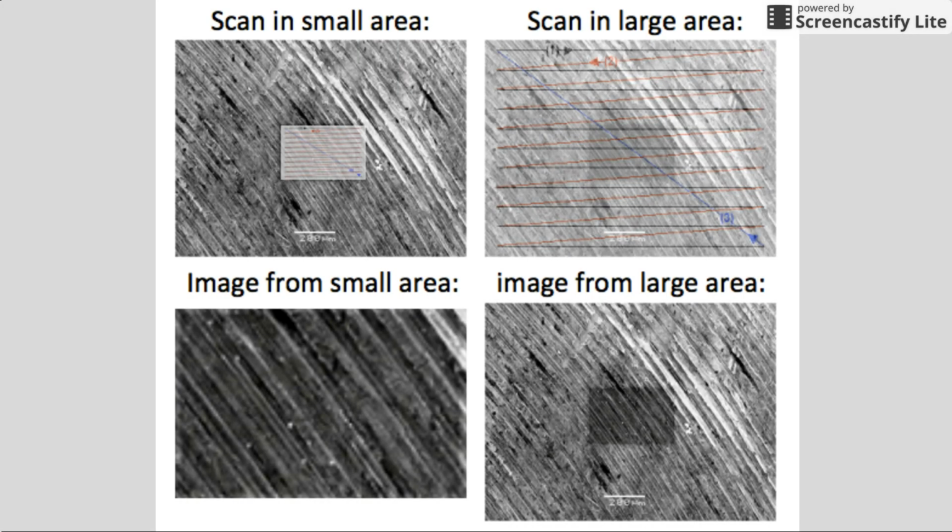The magnification in SEM is determined by the size of the area where the electron beam is raster scanned. Scanning in a smaller area will give higher magnification, whereas scanning in a larger area will give a lower magnification. Areas ranging from approximately 1 centimeter to 5 microns in width can be imaged in a scanning mode using conventional SEM techniques, thus getting a magnification ranging from 20 times to approximately 30,000 times, with a spatial resolution of 50 to 100 nanometers.